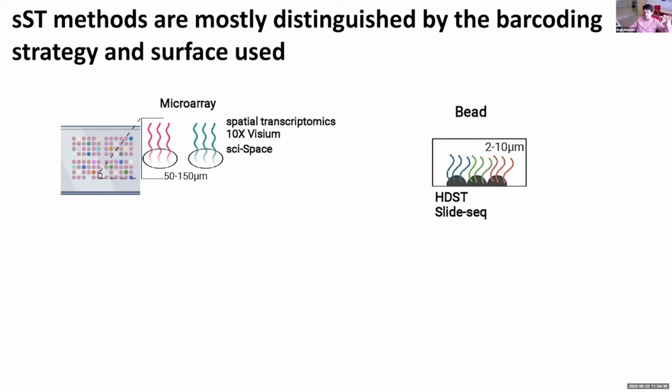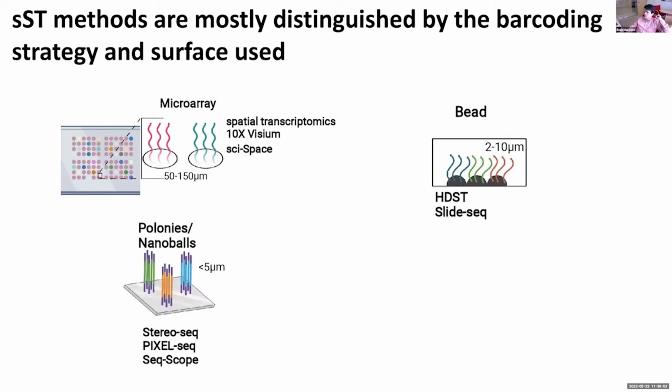And the nice thing about beads is that they can be nicely packed together. They aren't liquid, so you don't have to worry about, when you spot 2 liquids next to each other, they obviously can run into each other. So you can get very, very nice packing of the surface in that way. And we can get down to small numbers of microns with existing DNA synthesis tools and existing beads that are compatible with synthesis.